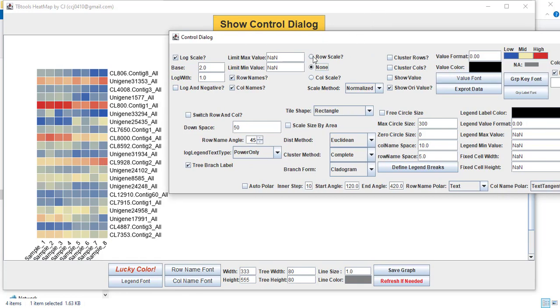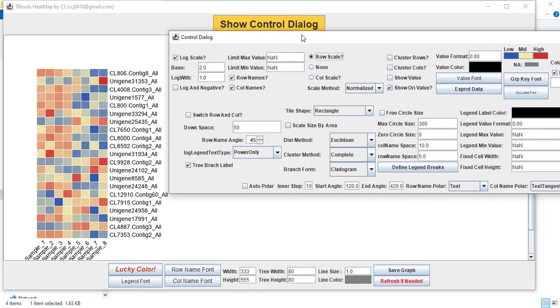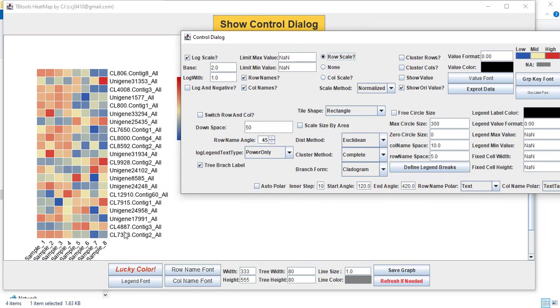But if you choose row scale, it will only arrange the expression values from sample 1 to sample 8 for just an individual gene, not for all the genes. So each row represents each gene. Choosing row scale means it will show the expression for just one row and will not manipulate other rows.